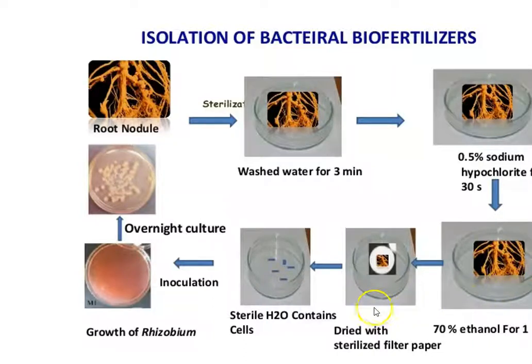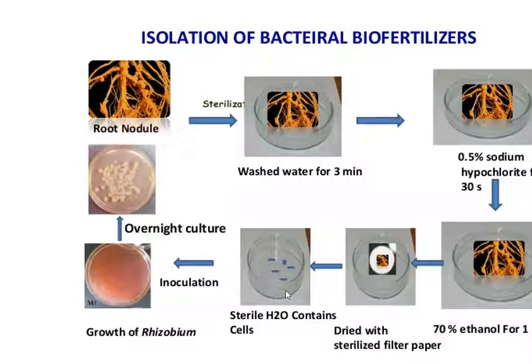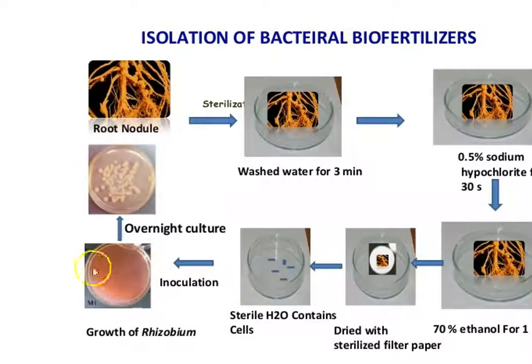After sterilizing, take the nodule contents in a petri dish or test tube. Add 5 ml of sterile water, wash 2 to 3 times with sterile water to clean thoroughly, then crush the nodules using a glass rod. From the crushed solution, directly streak onto the Yeast Extract Mannitol Agar plates.